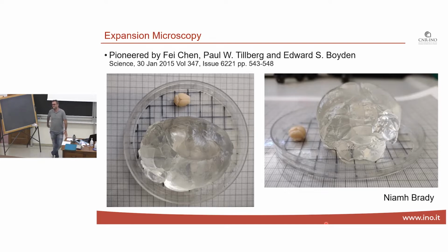But because it's not the same, you have no proof that you didn't make any alteration, because by modifying the original instance you are getting the wrong information. But well, let's say we are doing mostly cell counting things, so we're not interested in a perfect result, but I think it's still useful.